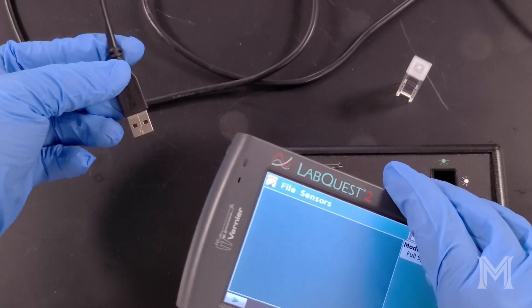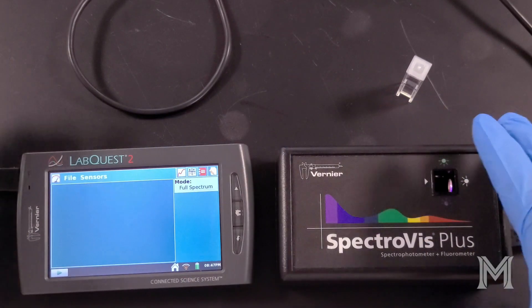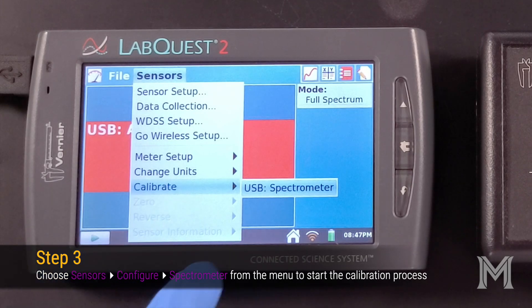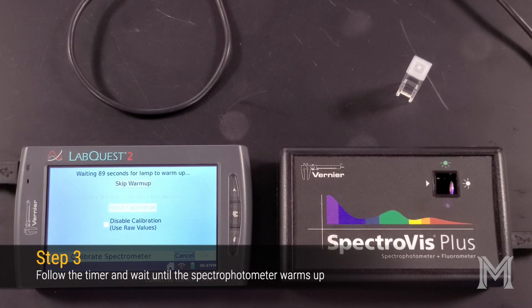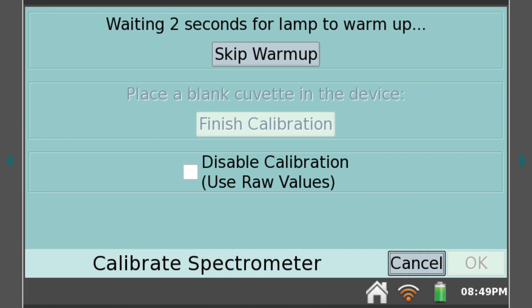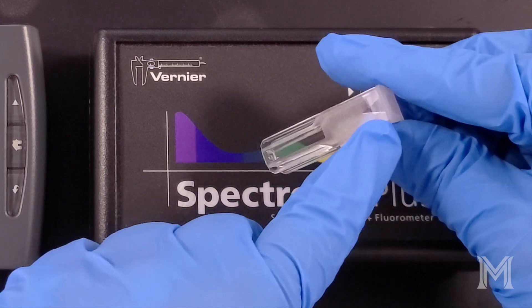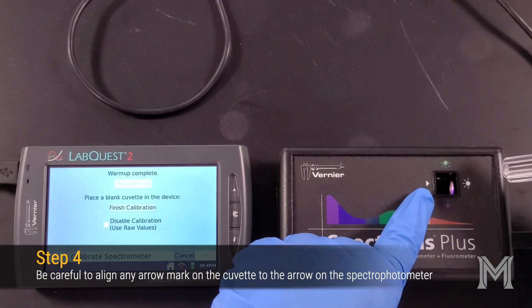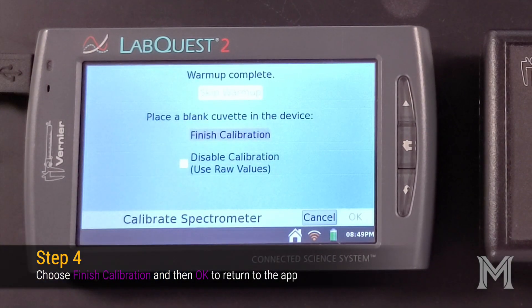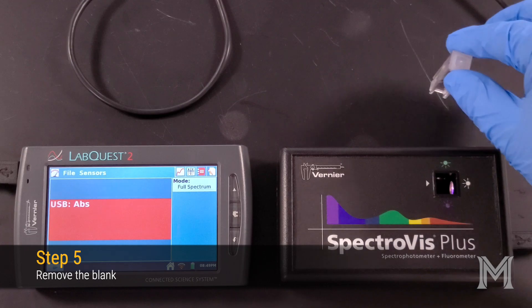Once you've correctly attached the spectrophotometer to the LabQuest, you should see a screen that registers absorbance. Before we can use the spectrophotometer, it needs to be calibrated. To do this, select Calibrate from the sensors menu. This will initiate a warm-up timer for the lamp, allowing us to get consistent results. To finish the calibration, insert your blank sample into the spectrophotometer, making sure that the arrow on the cuvette lines up with the arrow on the spectrophotometer. Now select Finish Calibration and then OK to complete the calibration. Then remove the blank sample from your spectrophotometer.